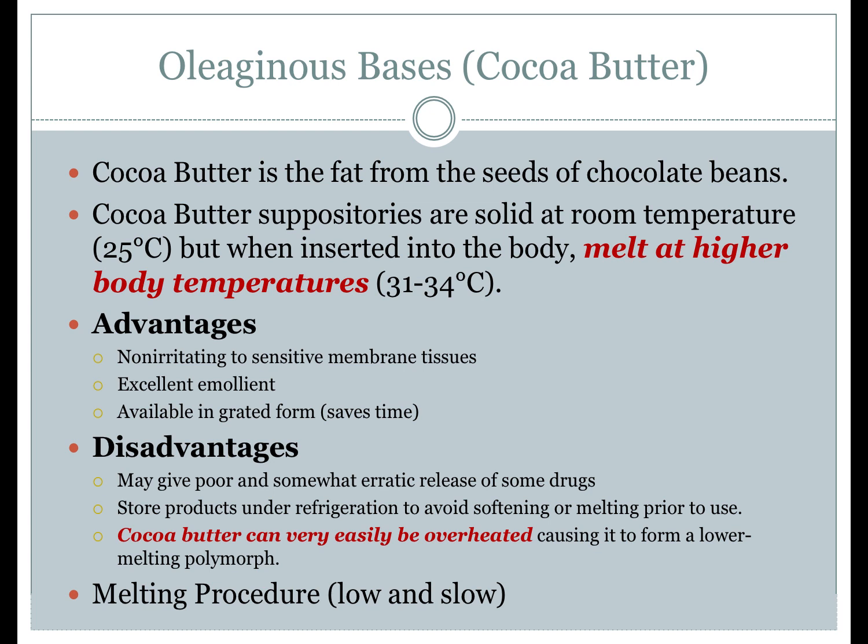You need to monitor the temperature and not exceed 35 degrees Celsius. Doing so increases the chance of creating polymorphs. The beaker should be removed once the base is molten and has an opalescent, creamy appearance. This process is time-consuming, and the pharmacist must have a lot of patience. Rushing through the heating process often leads to polymorphs and the suppositories that melt in the hand.